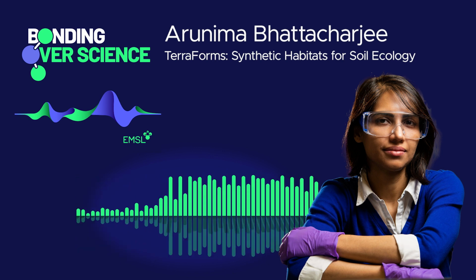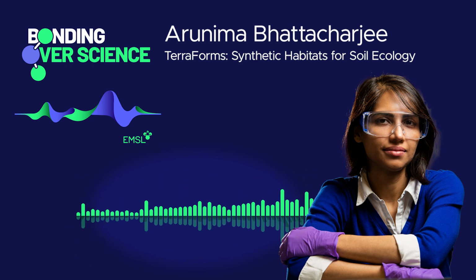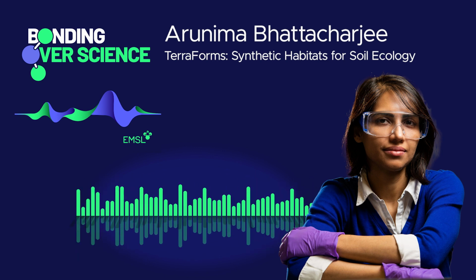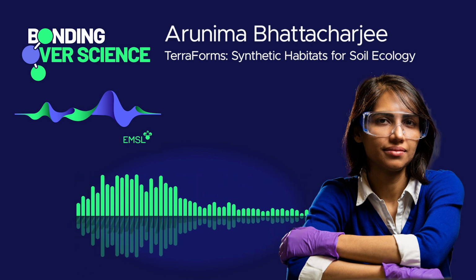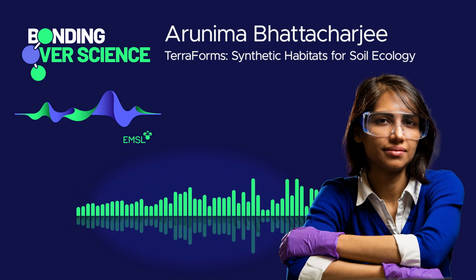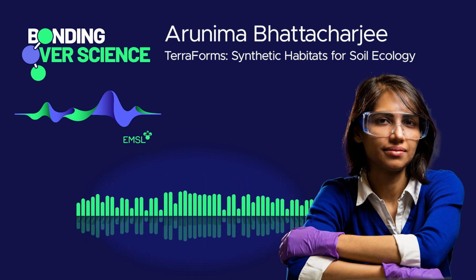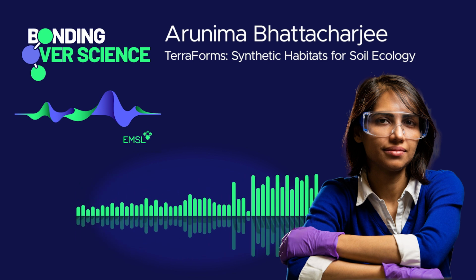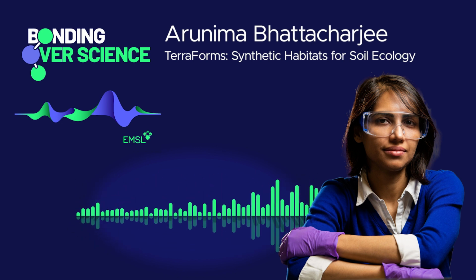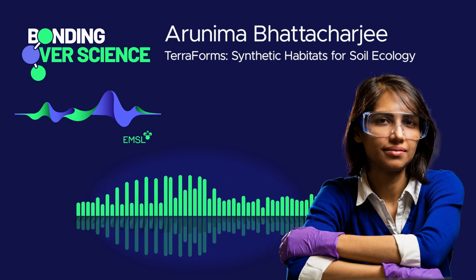Start off by just introducing yourself and telling me a little bit about your research and the path to your research. So I'm an earth scientist, and I've been at EMSL now for a little over 5 years. I was hired on the soils SFA as a postdoc, and I started working with soil microbes, to see how in different moisture conditions, microbes grow in soil and degrade carbon, and specifically to use imaging mass spectrometry. So looking at using different types of chemical imaging to understand the metabolite distribution as these microbes grow around these carbon substrates.